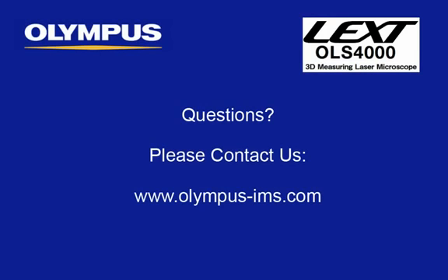In this instructional video, we have covered how to measure roughness with the Olympus LEXT OLS4000 3D measuring laser microscope. We hope this video has been beneficial, and we invite you to contact us directly with any questions whatsoever.